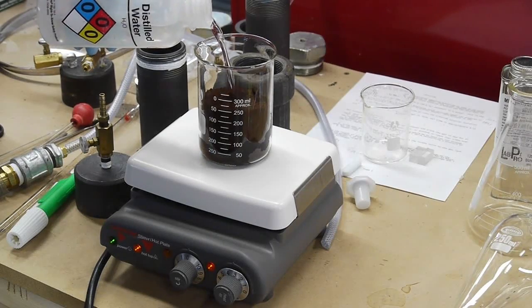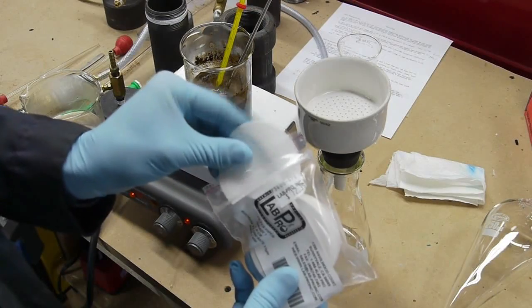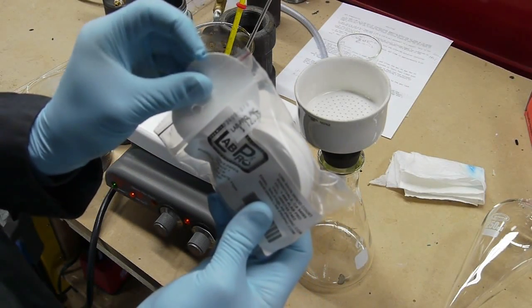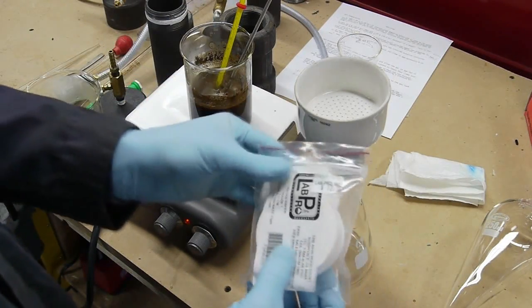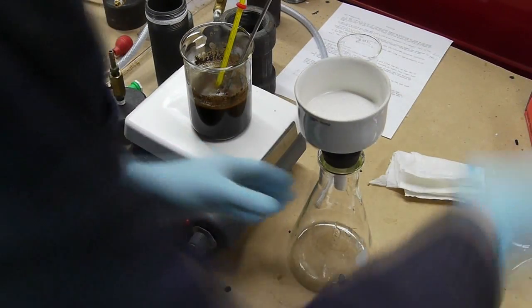And I loaded the coffee into a vacuum filtration setup and I used 11 micron filter paper and sprayed a little bit of water down first just to keep the filter paper pulled down onto the Buchner funnel and applied vacuum.